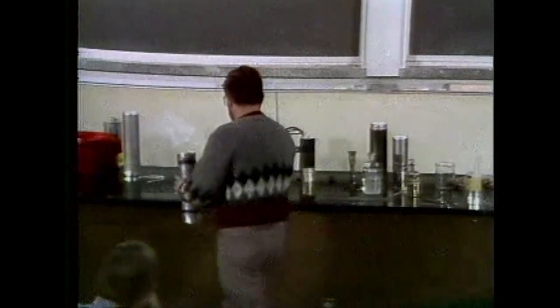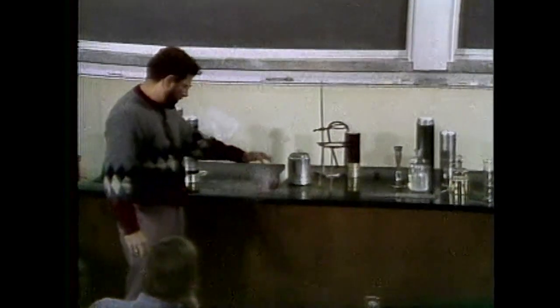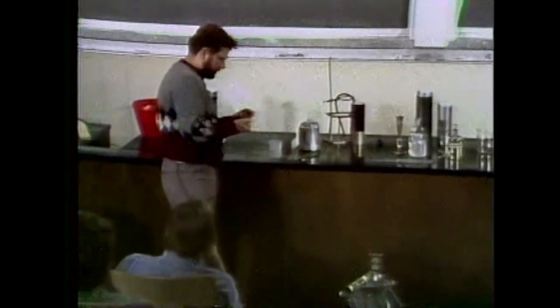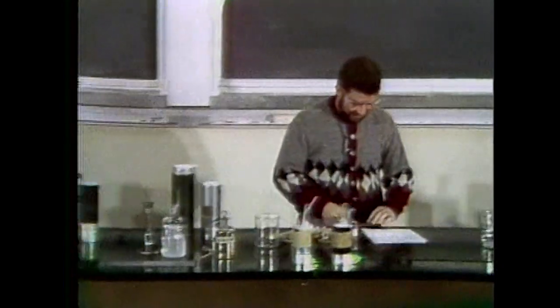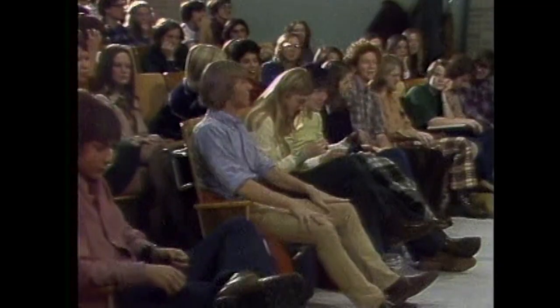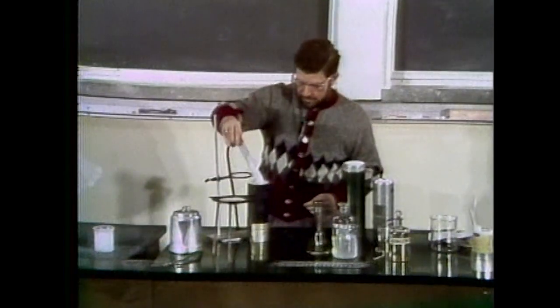Okay. Of course, substances change their properties as you change the temperature, and let's see what happens. It's so cold. Let's see what happens to it. That's a shattering experience. If you think that was bad, wait till you hear the rest of this. Another thing, let's see, how are we doing here? Well, this is beginning to freeze. This is beginning to freeze. And how are we doing here? We're doing fine.